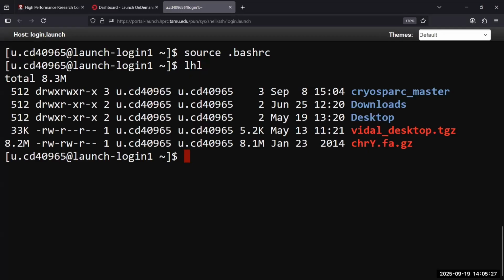And then you don't have to source it next time you log in. We're just sourcing it this first time because you've already got a shell open. When you leave and you start a session again, you don't have to source again because when you open a session, it automatically reads your bashrc. But we needed to reread it because we just made an edit.